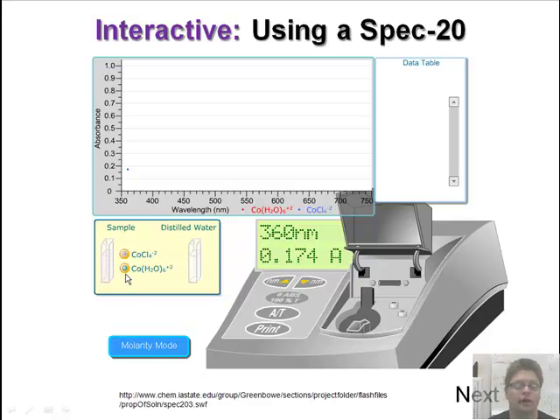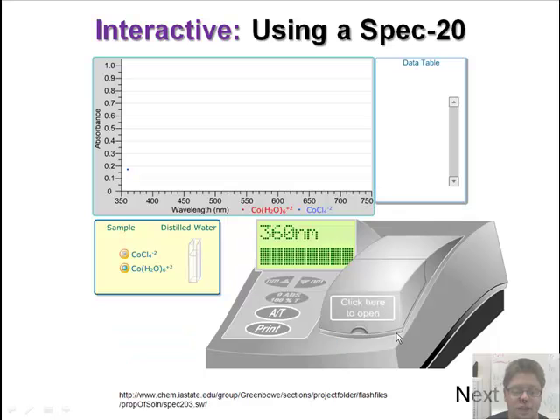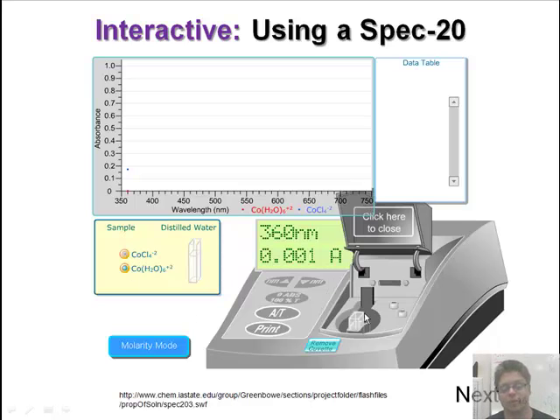Now we can try another sample. Here's our cobalt, looks like cobalt hexaaqua. Take a sample of this. Place it in. Close it down. We get a different absorptivity value. You'll notice here are the points for the measurements. So this is comparing two different samples. Usually, you'll want to take one sample over time or get a standardized.